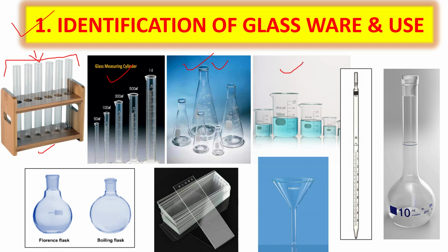Next is beaker. So here also you can collect the volume of water or volume of reagents or solutions or perform any reactions. Okay, next is glass pipette. So by glass pipette you can transfer minute amount of samples from one container to another container.